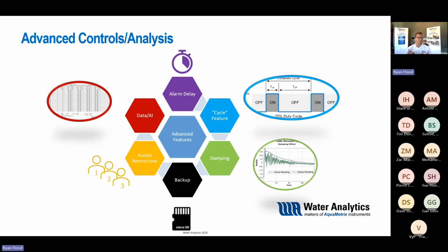Damping is another great feature for those not familiar with it, where again, if you're getting some signals, as you can see here on this graph, they are jumping up and down a little bit. There's some variation.